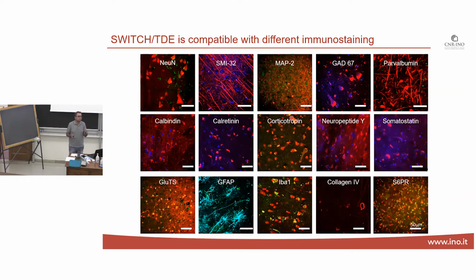now, since the sample is completely transparent, then what do we look at? We look at fluorescence. So these are methods that work with fluorescence. This can be either endogenous fluorescence of proteins or molecules that are intrinsically within the sample and are fluorescent when excited with a laser light, or most of the times we do staining with fluorescent antibodies. These are examples of completely different antibodies targeting different parts within the cell, and different structures within the tissue.